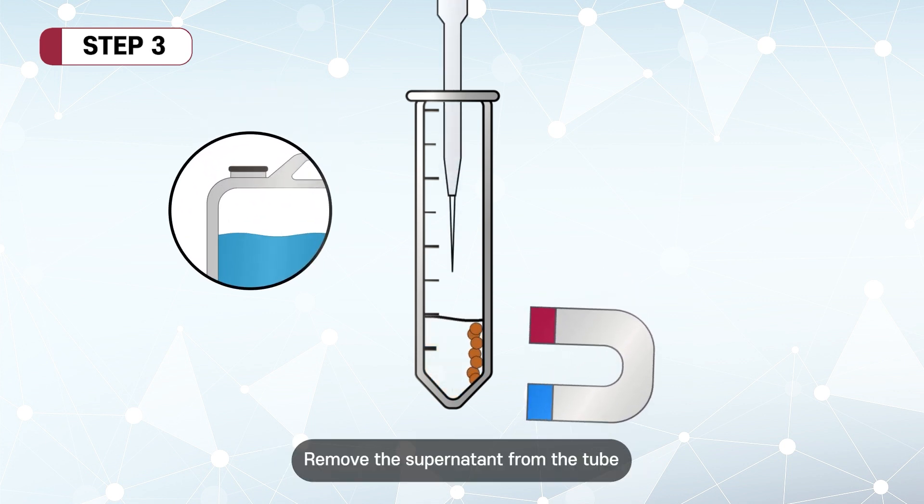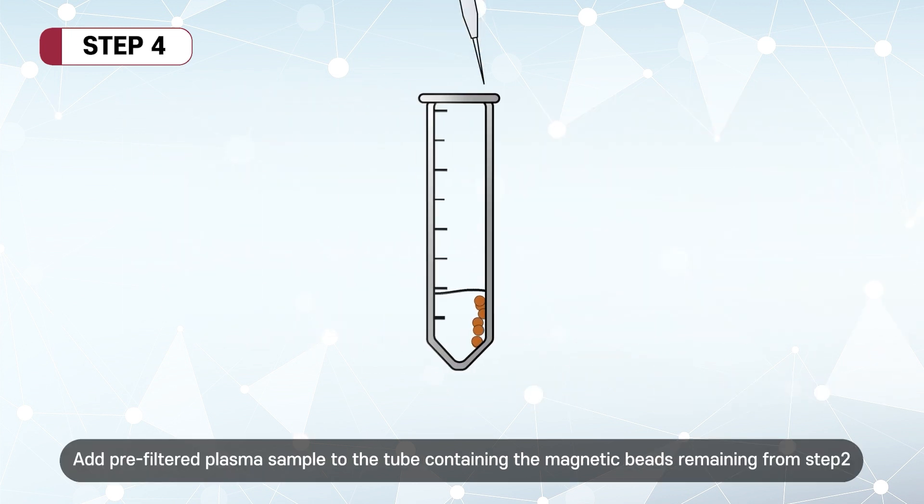Remove the supernatant from the tube. Add pre-filtered plasma sample to the tube containing the magnetic beads remaining from step 2.